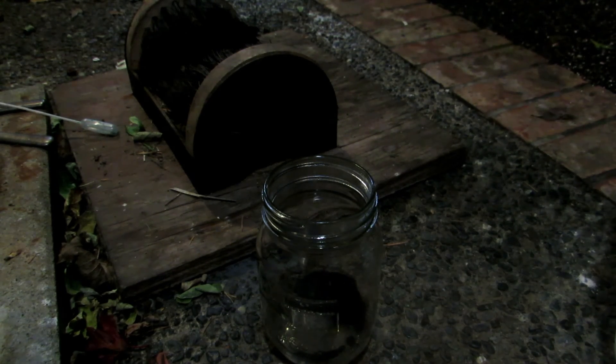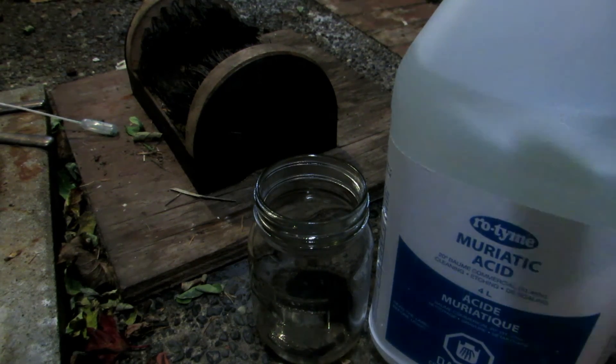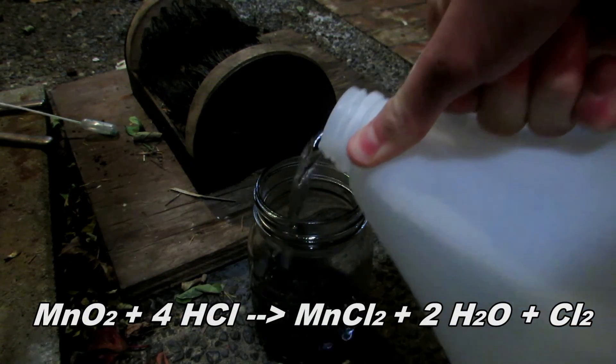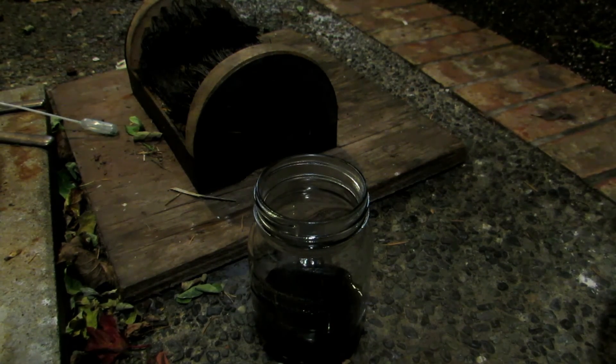Pottery grade manganese dioxide does contain impurities such as carbon and probably some others, so this is not going to look very nice after doing this, and we will most likely have to end up filtering our solution to get rid of any impurities such as carbon. So we'll simply take our hydrochloric acid — this is just muriatic acid which we bought at Canadian Tire — and add some to this. Remember, this produces toxic chlorine gas. We'll mix it around and make sure that everything reacts.